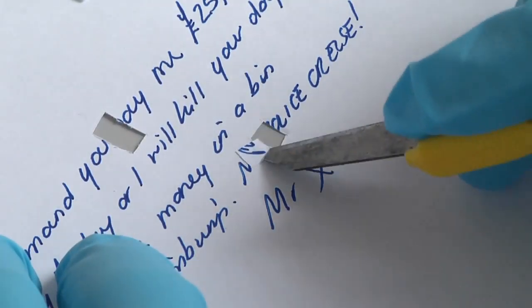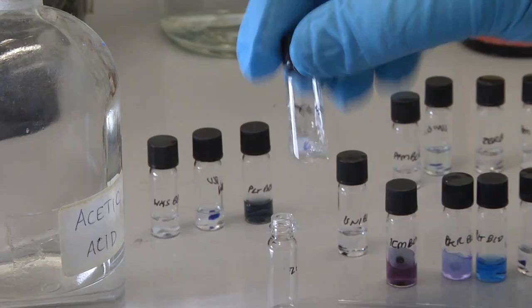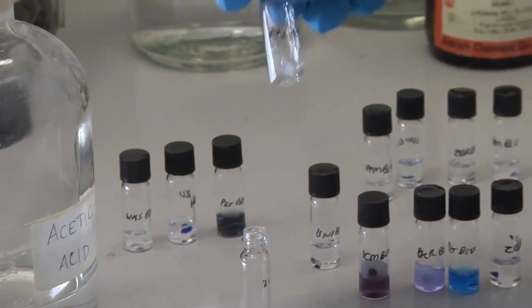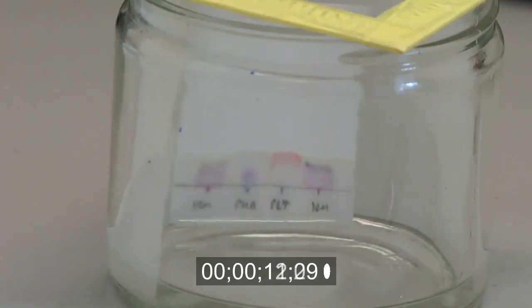Samples of the ink are removed from the document, dissolved into a chemical solvent, and transferred onto a flat TLC plate. By placing this plate upright in a glass tank containing a small amount of a specially chosen solvent mixture, the different dye components present in different ink samples can be separated out and compared to see if the components from different areas of ink on a document are the same or different.